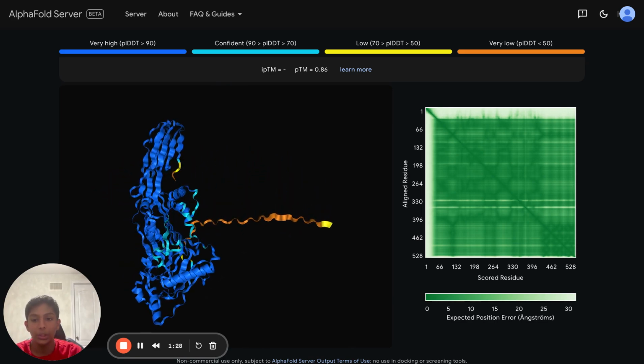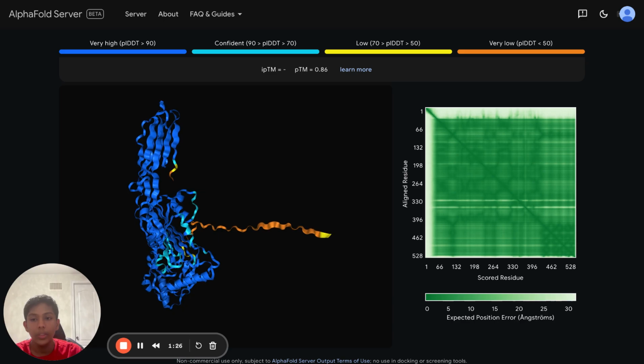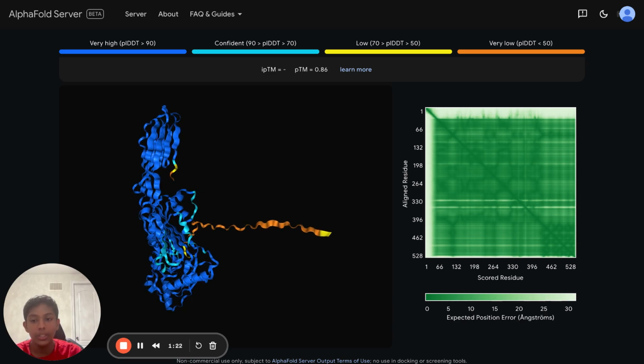So what can we actually do with this protein? So with the model, we can actually predict how this protein will interact with other proteins and how that will affect its function or its job. And we can use this for multiple applications. And for example, in nanomedicine, we can implement that information into a nanorobot and hopefully try and replicate the job of a protein.